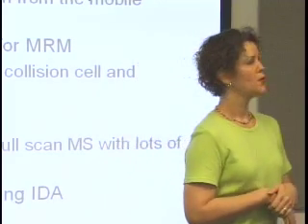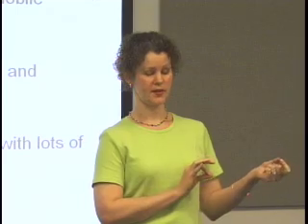It was yesterday. What else did we do yesterday? We showed you guys how to do batches, how to submit samples. We reviewed test mixtures, what we put in the test mix, what we considered to be good indicators of instrument suitability, and why we put those things in there. We looked at some data. You guys actually processed some data yesterday and looked at it. We went through some compound optimizations, so you guys saw how the instrument will generate some data for individual compounds, and you're going to use that data to create methods.